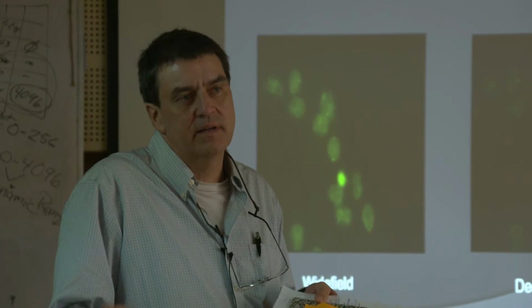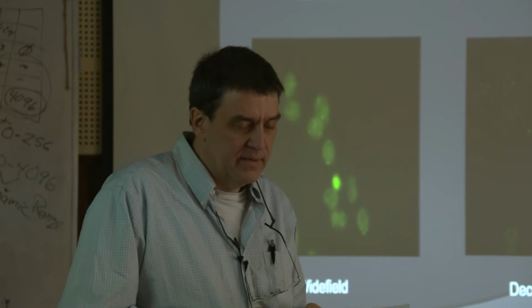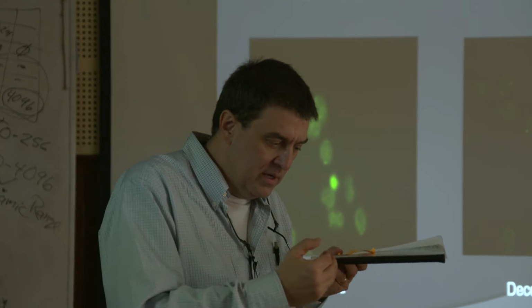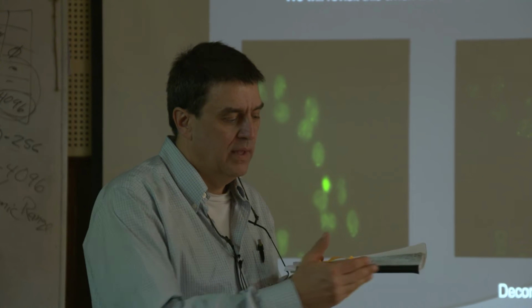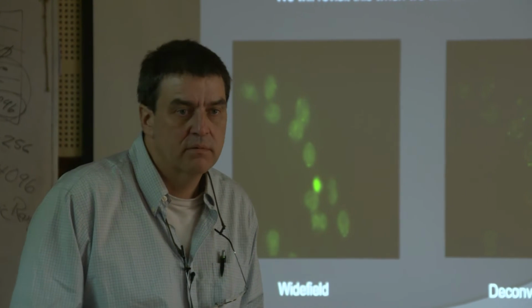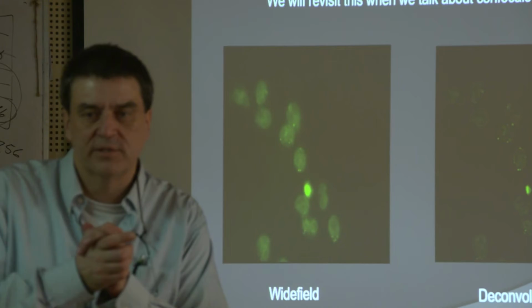Okay, but like I said, starting a lab, for most of the things you can do, wide field's great. I mean, it works like a charm. But when you need that thin plane, that real good focal plane, and we'll talk more about the other applications of confocal, then yeah, confocal's the way to go. Okay, but expense. Okay, any other questions?